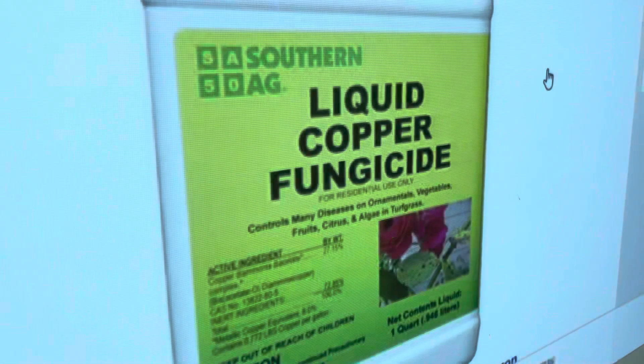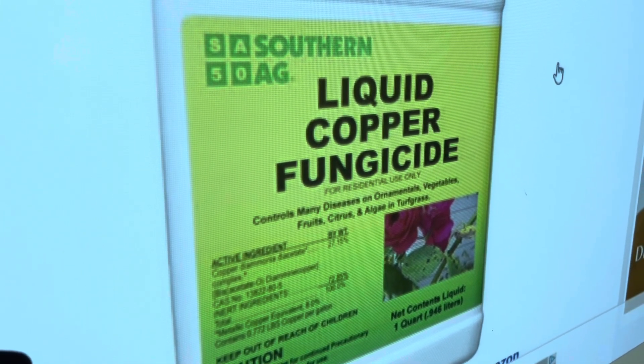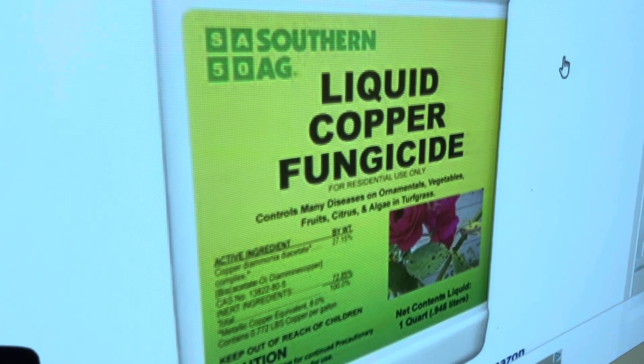Just amazing. Look at that. Interestingly, copper hydroxide is used as a fungicide to spray on fruit trees that have fungus or bacteria growing on them.